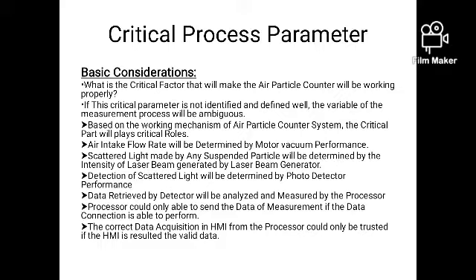How to identify the CPP? Please consider the following analysis. 1. Answer the question of what are the critical factors of the air particle counter system that hold an important function, so that if these important things are not working, it will make the counter malfunction.